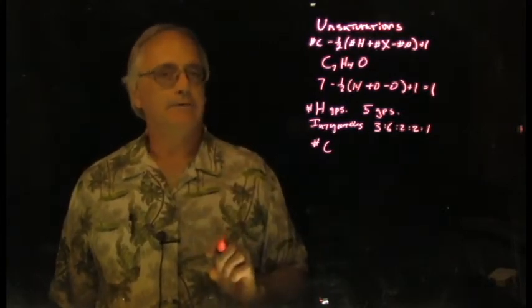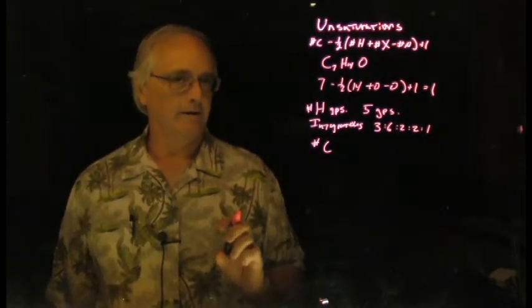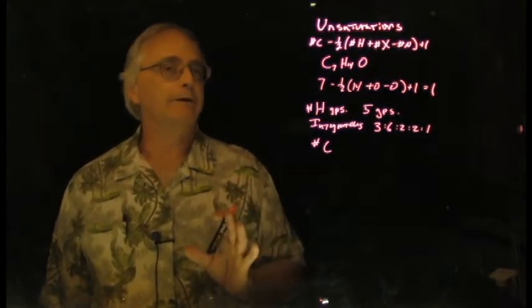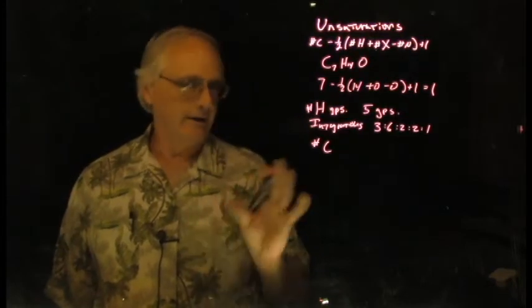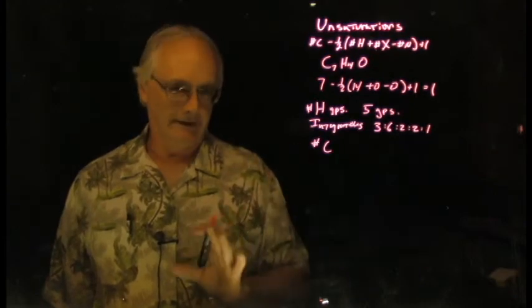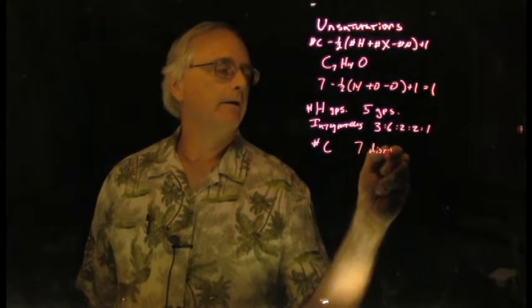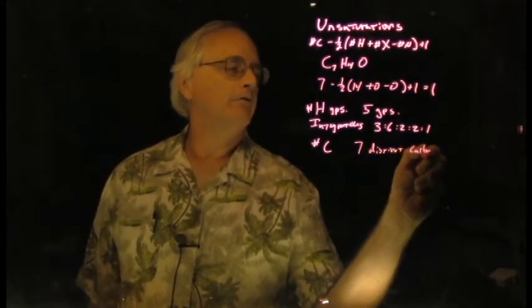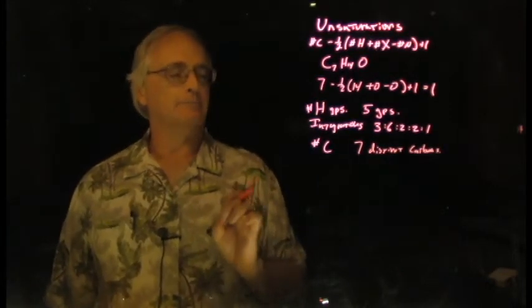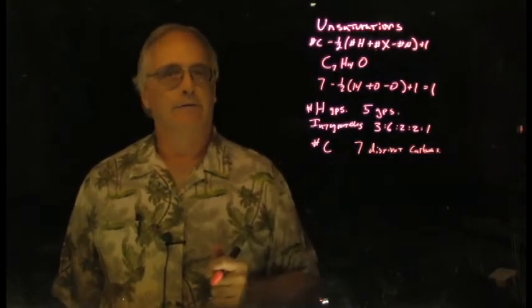Looking at the carbon spectrum, again we ignore the solvent peaks. There is a small solvent peak in the proton spectrum, and it's clearly marked on the spectrum provided. And there is a solvent peak of the carbons. We ignore those. They're not anything we look carefully at. But looking at the remaining carbons, not the solvent, we see 7 of them. There are 7 distinct carbons. 2 of them are fairly close together, but even on paper they look distinct, and that is exactly the number of carbons here.